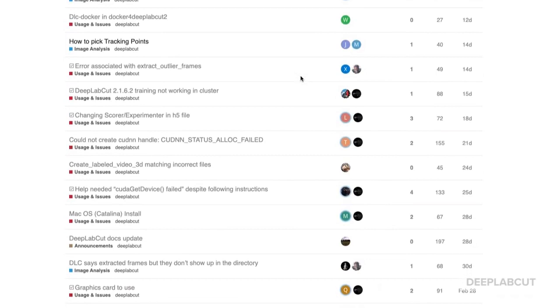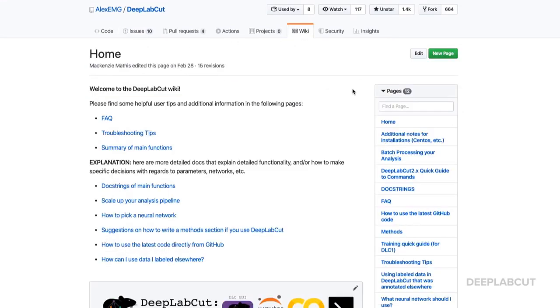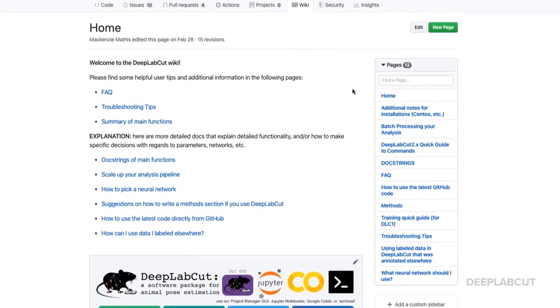The developers are also quite active — for example, I'm MW Mathis. Jumping back, I want to highlight the wiki. It's a little bit buried to find, but it has really important information: frequently asked questions, troubleshooting tips, how to pick neural networks, how to write method sections, how to use code directly from GitHub, and how to add in data labeled elsewhere. There's a lot of great information here that's updated quite often.